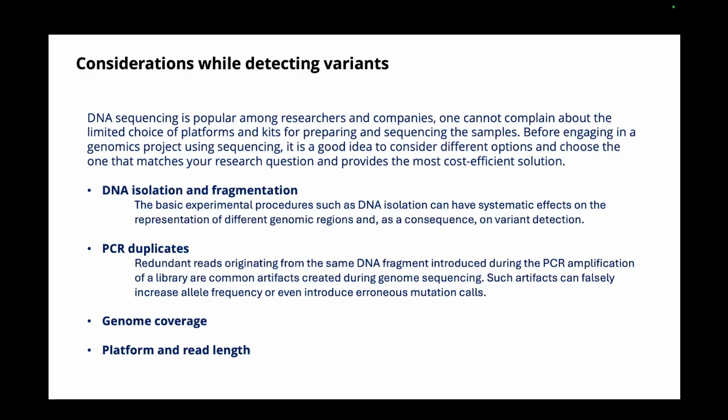But in the case of smaller variations, it's okay to have a small base pair length because it's just one nucleotide change, so it's easily identifiable even if you have smaller reads, because it's okay to support a single nucleotide change with the help of multiple 300 base pair reads. It's okay to do that, but it's not very okay to claim big structural variations.